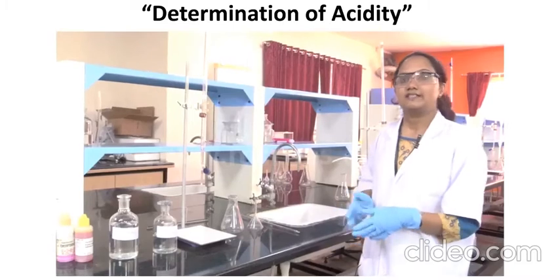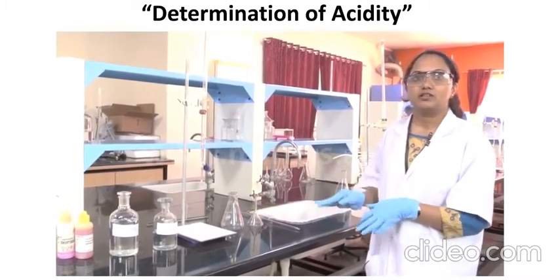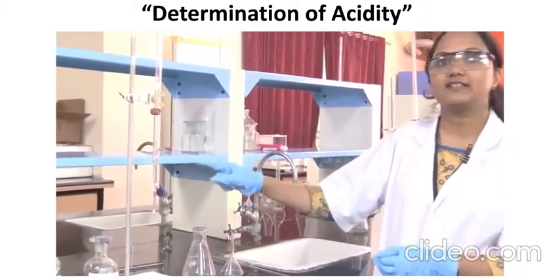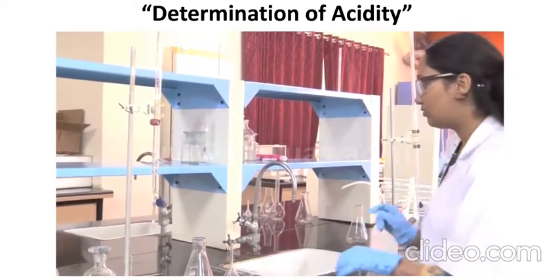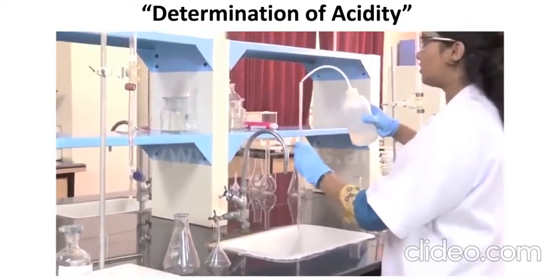Before starting with the experiment, we need to rinse all the glasswares, that is the pipette, the funnel, conical flask and buret. So we will rinse the pipette with the distilled water.